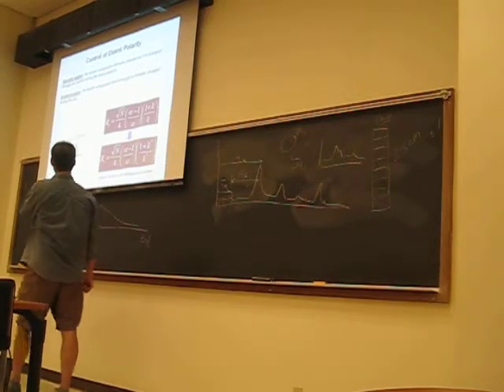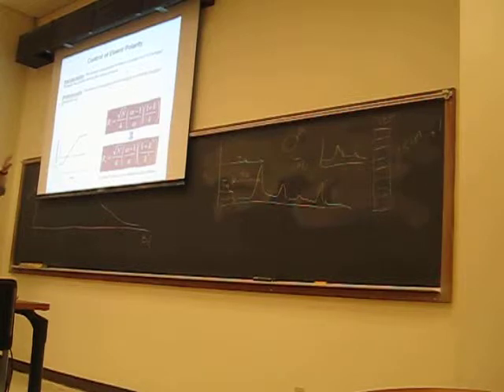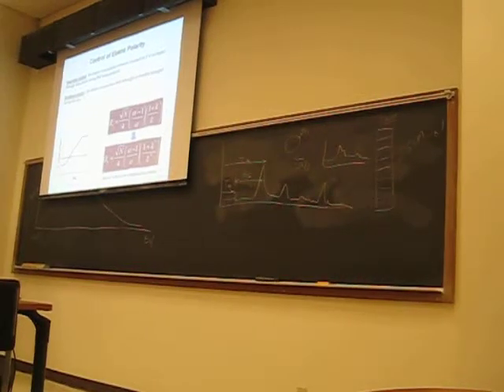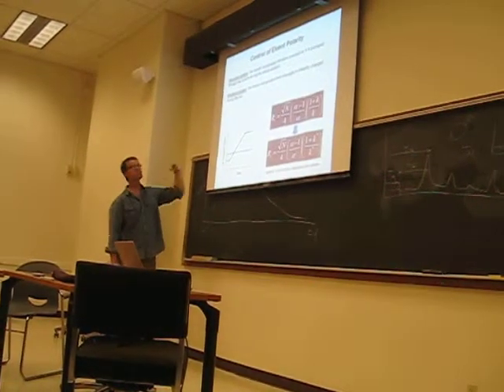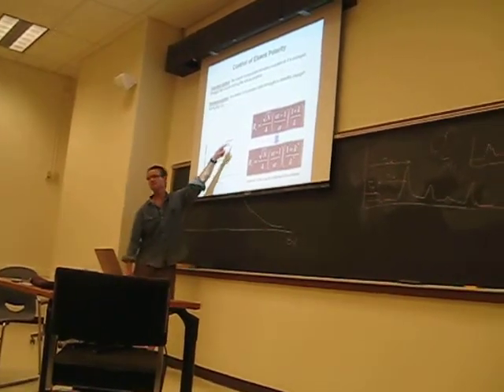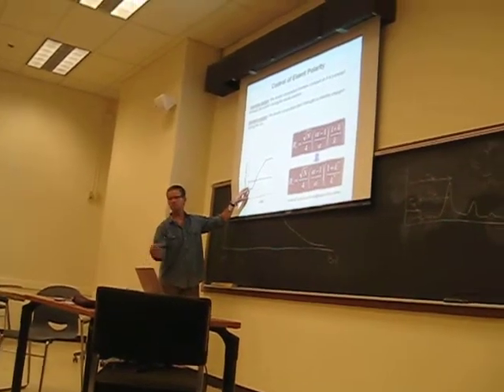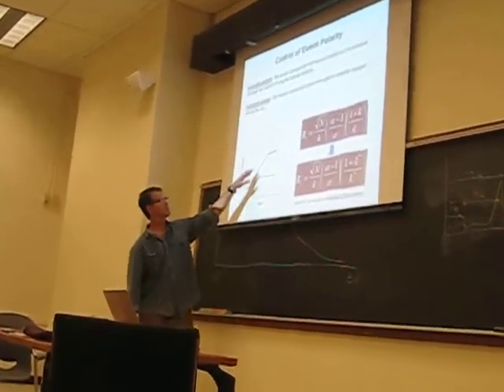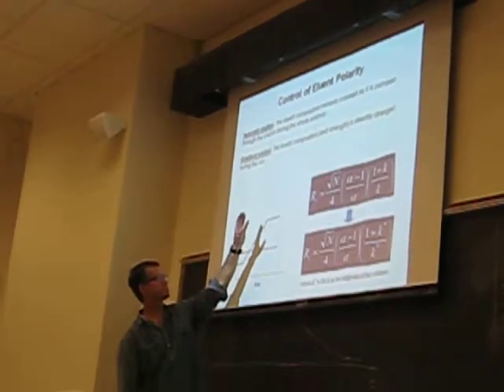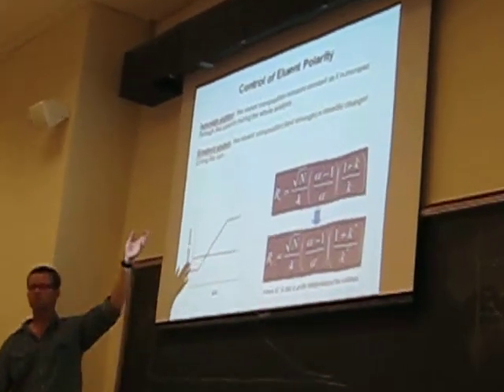Okay. I talked a little bit last time about different elution strategies, and the difference between an isocratic elution, which is where the composition of the mobile phase does not change over the course of the elution, versus a gradient elution, where the composition of the mobile phase does change over time, where you have maybe a mobile phase that was water with an acetate buffer, and one that was either acetonitrile or methanol or some sort of polar solvent.